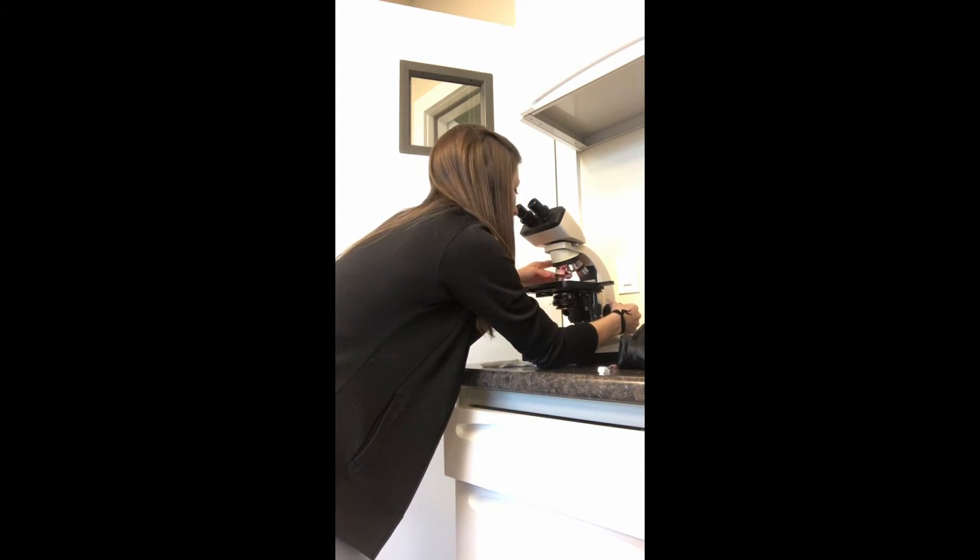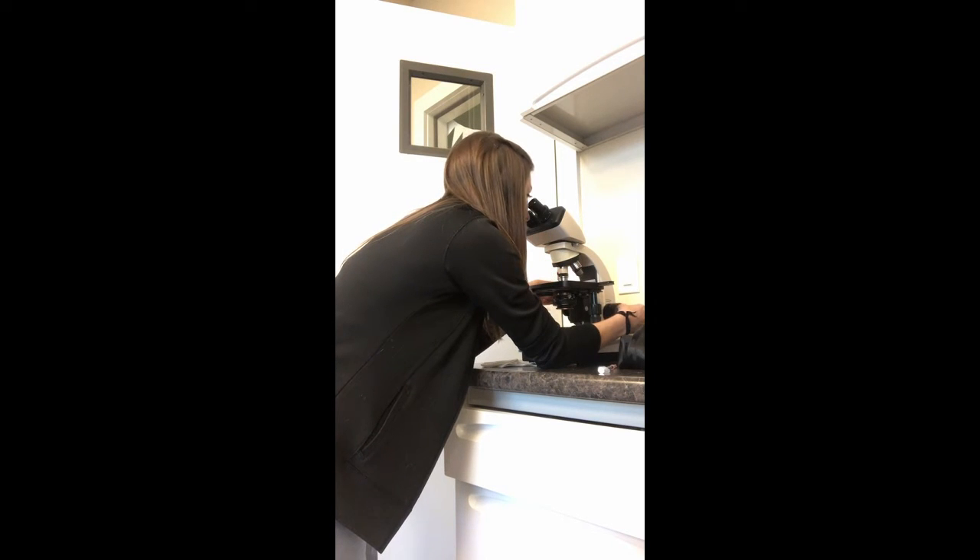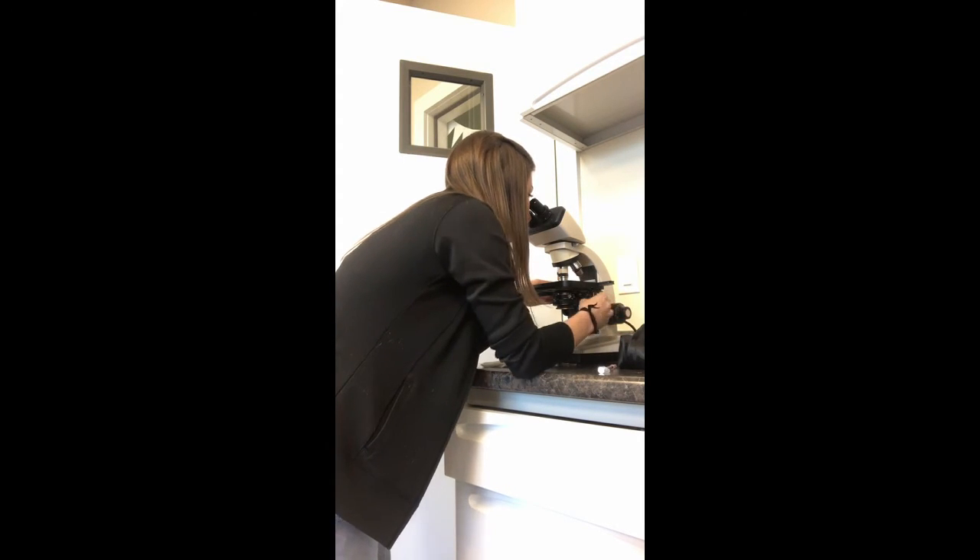Moving up to the next objective — still a low power, but 10 times. As that comes into focus, I can see whole red blood cells.